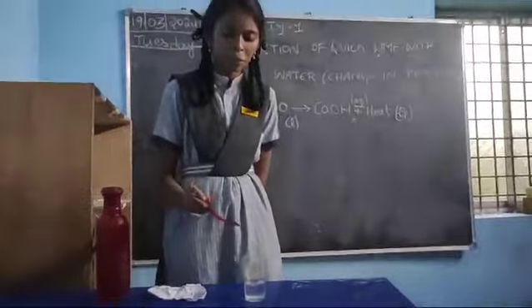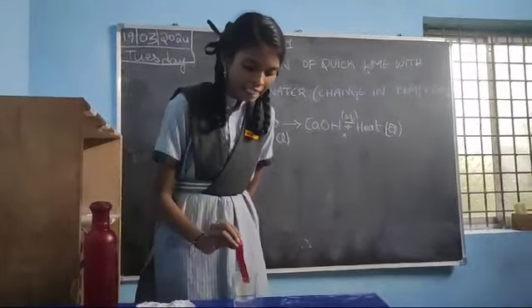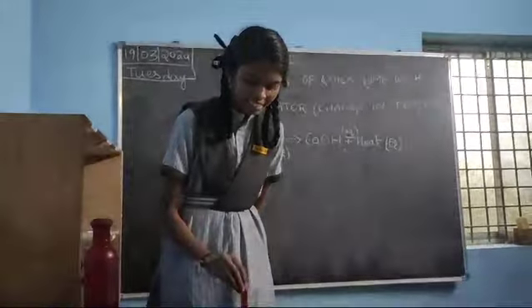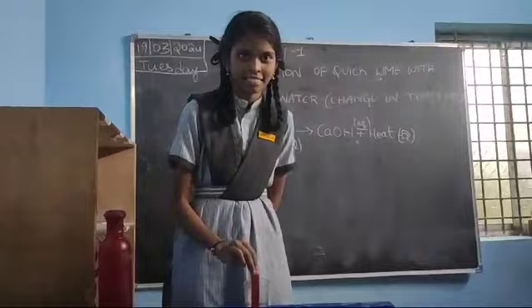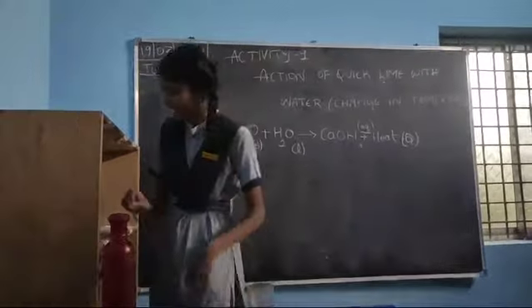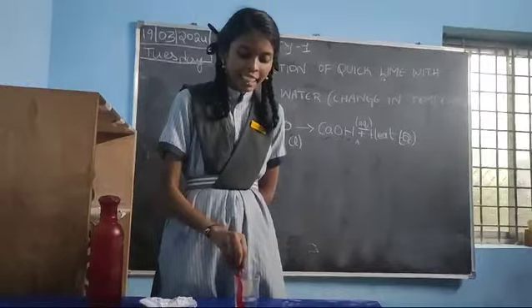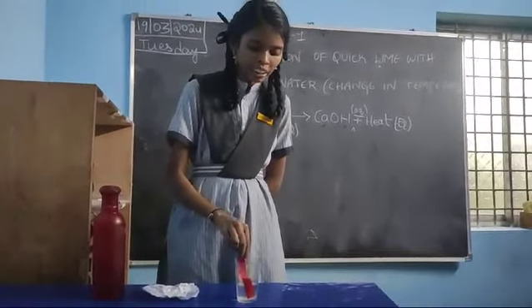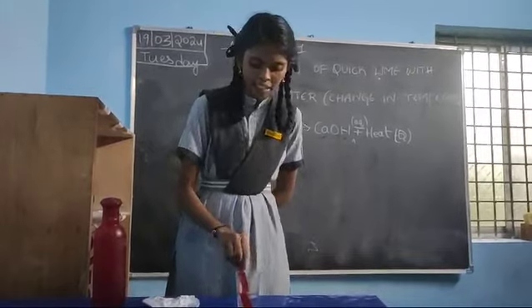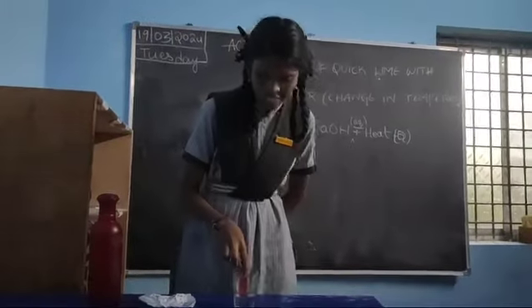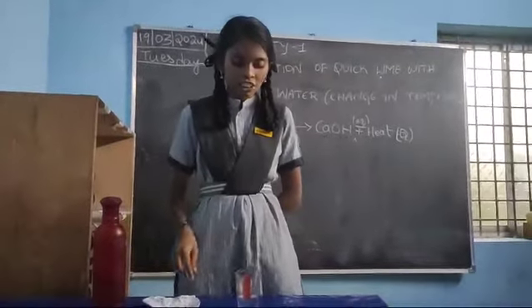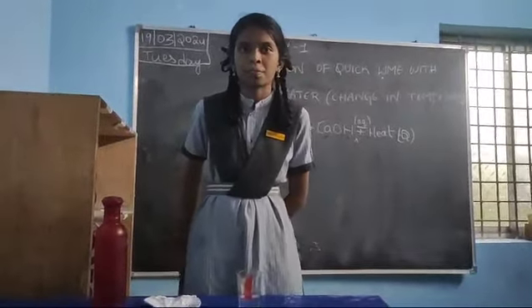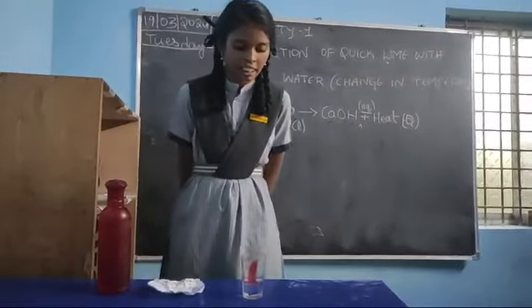Take a red litmus paper and dip it into this solution. The solution changes the litmus to blue. This means the solution is basic in nature.